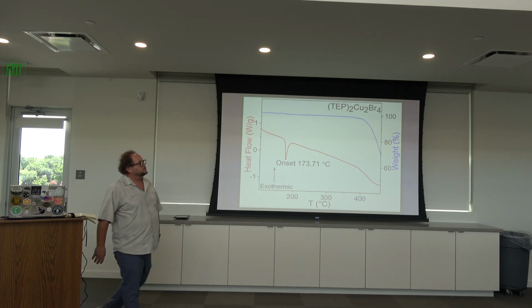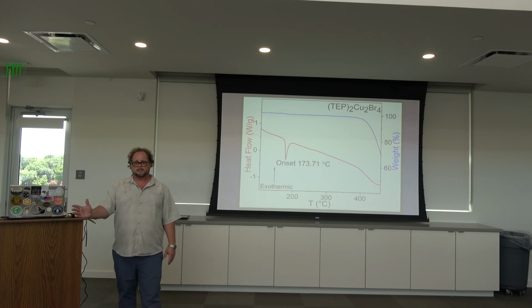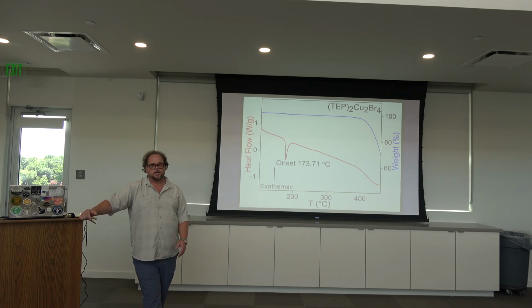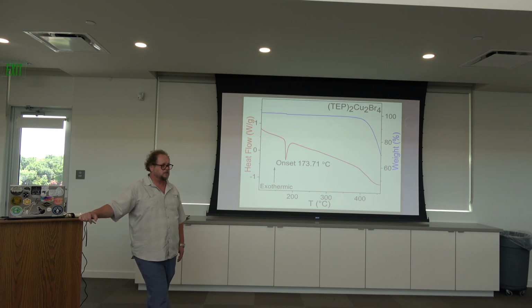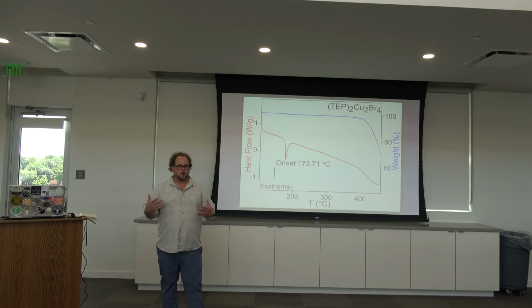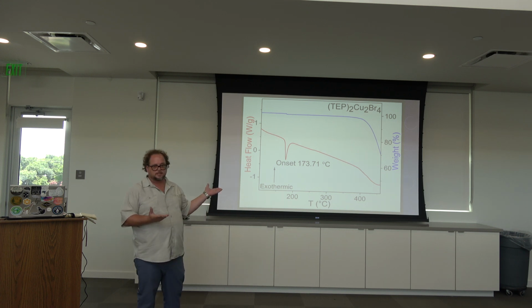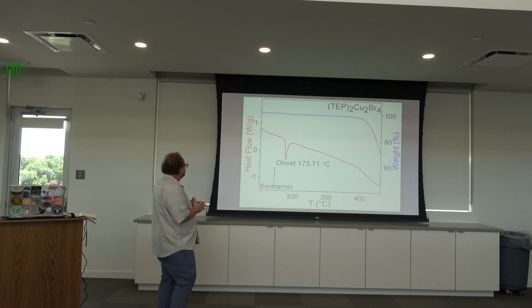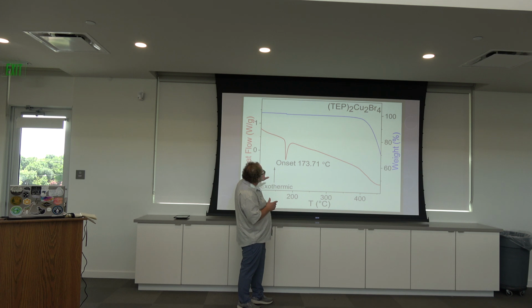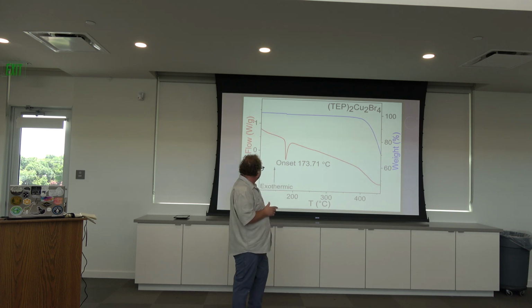Let's see. This test. So again, stability, how long are these compounds going to last? They don't tend to be super stable as a rule. So what's going to happen if we cook it to about 400 degrees C for a long period of time? Will it decompose at that point, start to break down, start to turn into something else, or will it remain and go back to a nice little crystalline structure that we want when it does cool down? And this test tells us that, so we're adding heat here, and we notice that the takeaway message is that when it does actually cool back down, it remains stable.